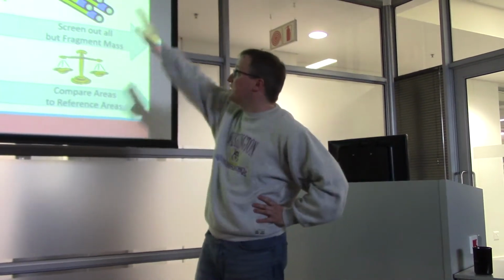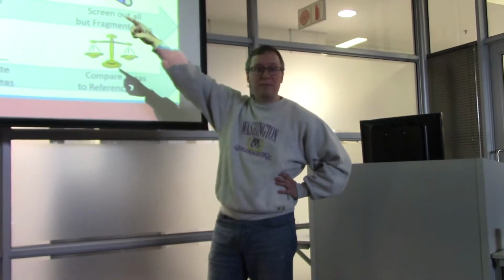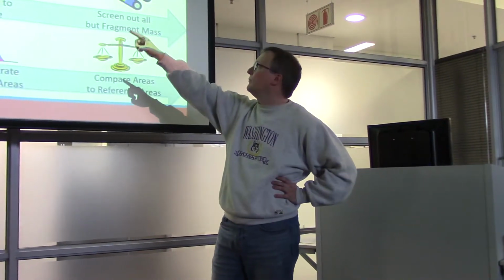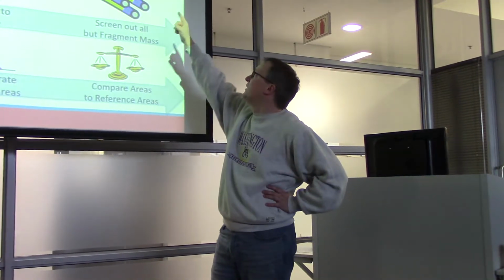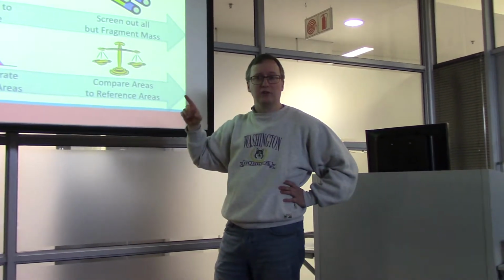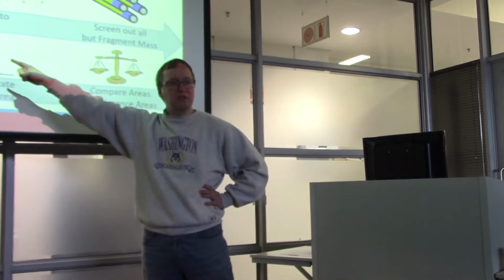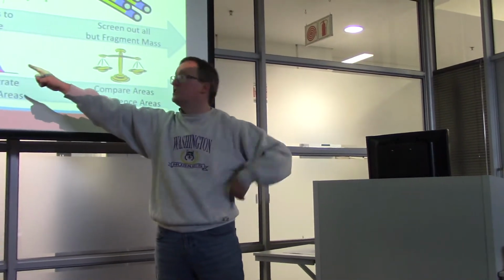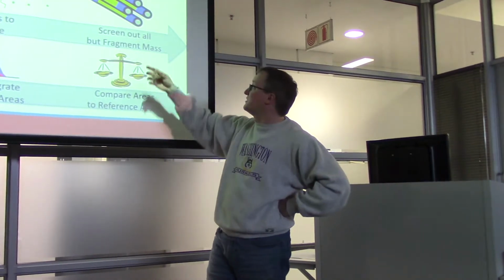So you can imagine the total targeted proteomic workflow, starting with a peptide mixture, we've already digested it up. We're using liquid chromatography, same as we did with shotgunning. We're still using electrospray ionization. But now the triple quad is screening out all but this particular peptide ion for this moment in time. We are colliding those peptide ions to cause them to dissociate.